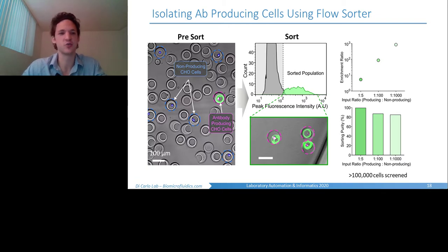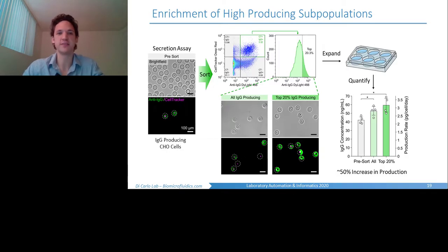But this is really just a control test to show that this assay and the sorting are behaving as we expect. We wanted to go a little bit further and see if we could do something a little more interesting on a functional level.